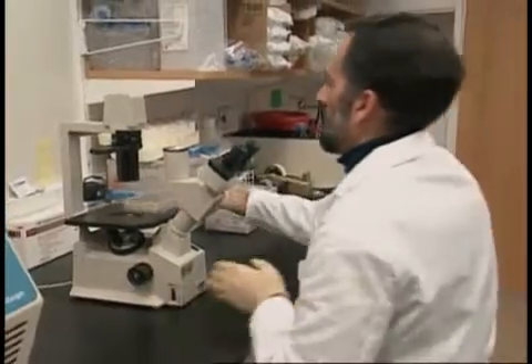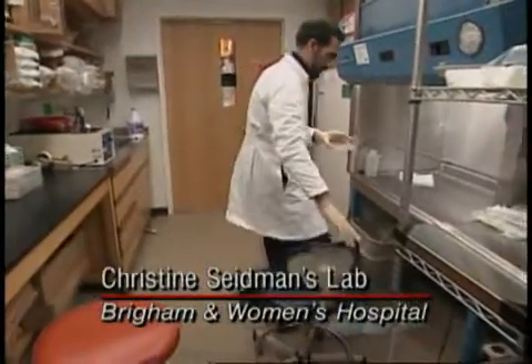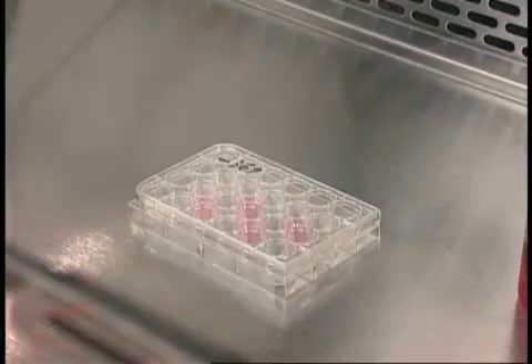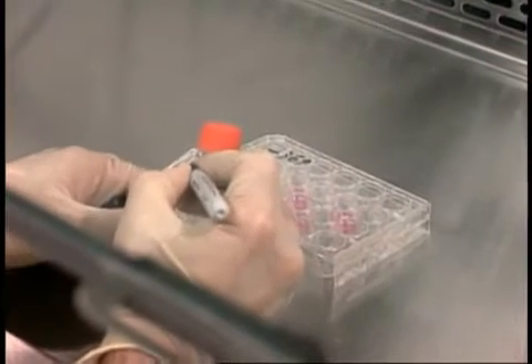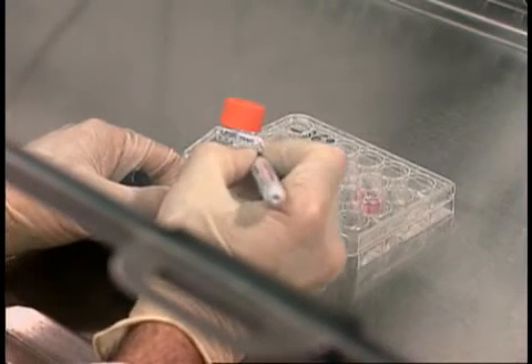Basic tissue culture work is a daily routine in many laboratories. Mohammed Miri could probably perform it on autopilot, but he knows that no cells can be guaranteed to be non-hazardous. Good work habits are important for good science, as well as for safety.